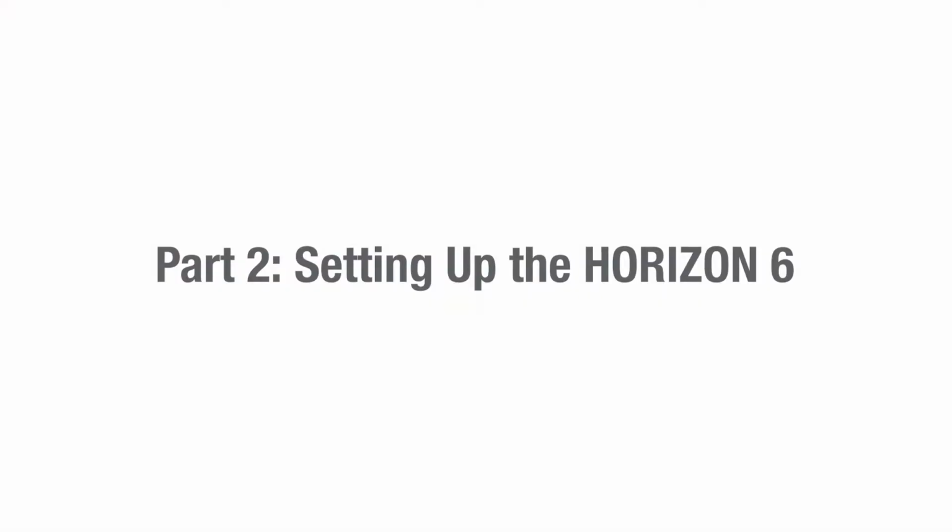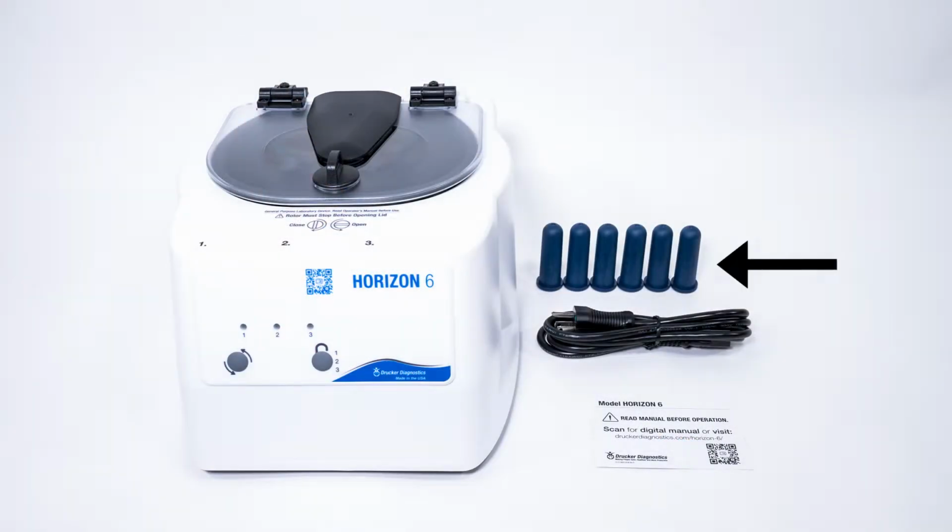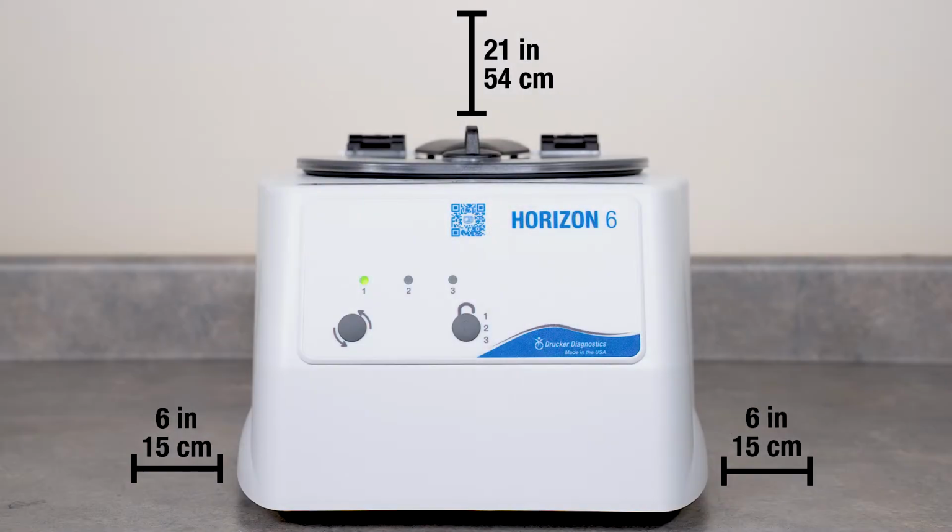Part 2. Setting up the Horizon 6. Let's start by making sure we have all our necessary accessories. These came out of your accessory kit, the small bag packed in with your centrifuge. You'll need your power cord, your tube holders, and your centrifuge. If you're missing anything, please contact Drucker Diagnostics.